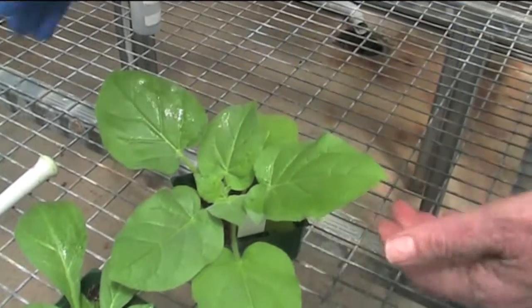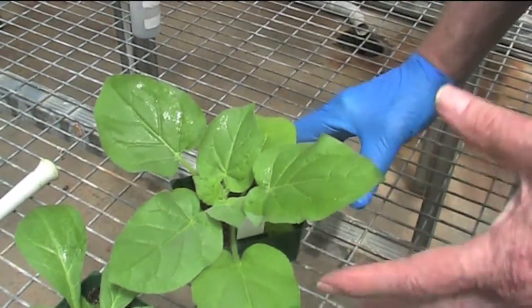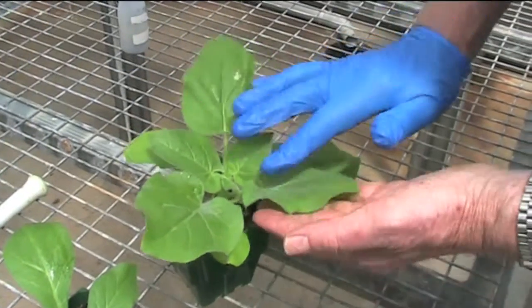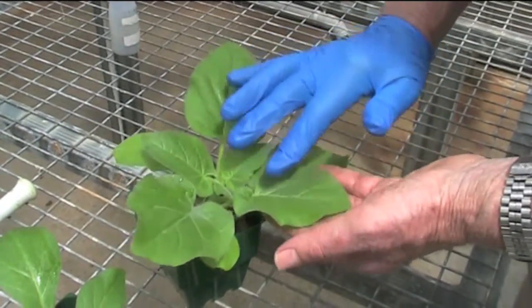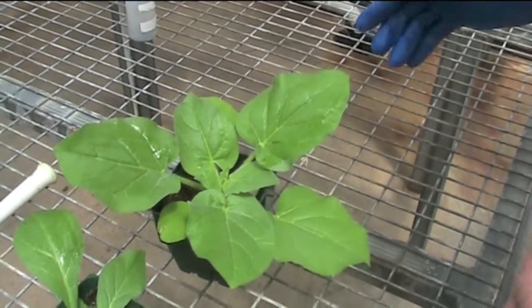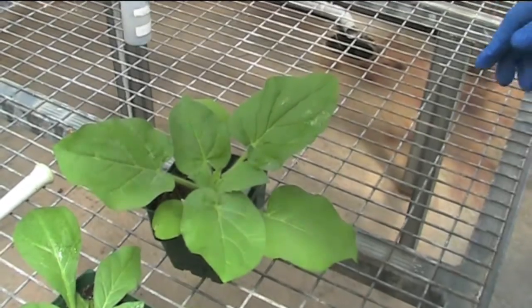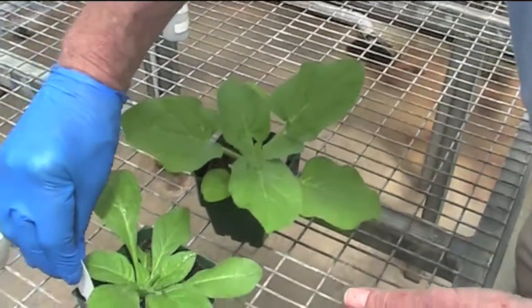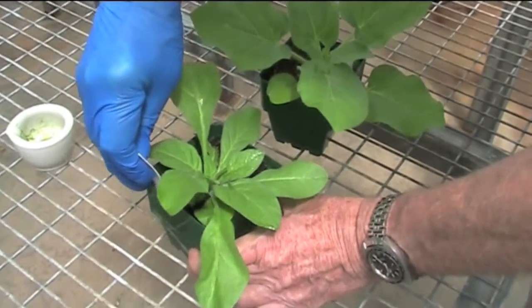After the inoculum has been applied, the virus enters a number of cells, uncoats, and starts its replication cycle. We then have to make sure that we label the plants with the virus and the date, so that we know when we should come back to check the symptoms.